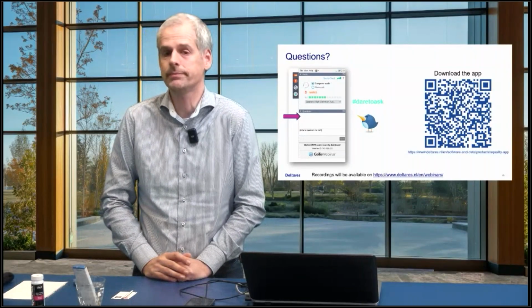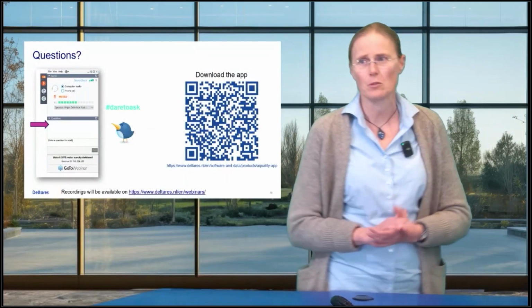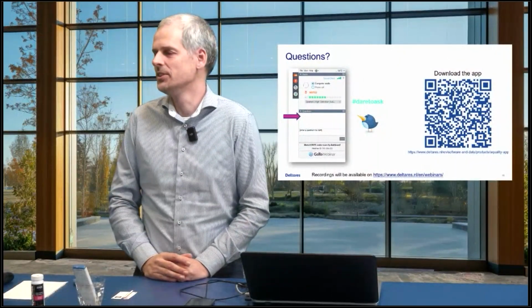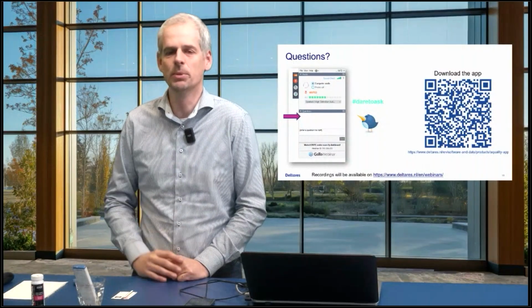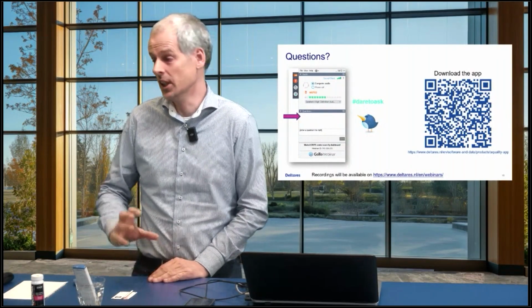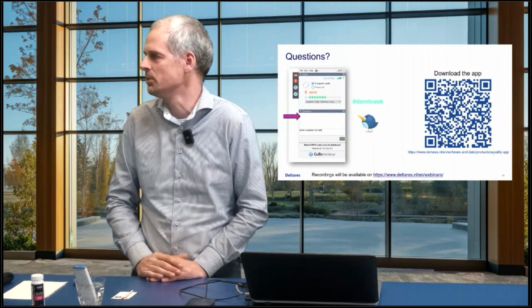Yeah, very interesting. And you showed some of the comparison with the lab for the nitrate, but did you also do that for the other parameters in the app already? Well, the salinity measurements are really accurate with this device. So that's really between 1% and 2% maybe in accuracy. We also tested these HANA checkers for phosphorus. They are not as precise again as lab measurements, but they're close to that.